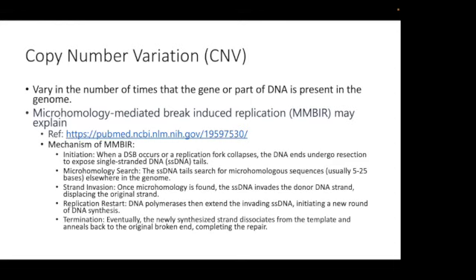How to detect the copy number? Let me show you the two different approaches, which is not actually written here. Two popular technologies that check the copy number variation: one is by chip, the other one is NGS.